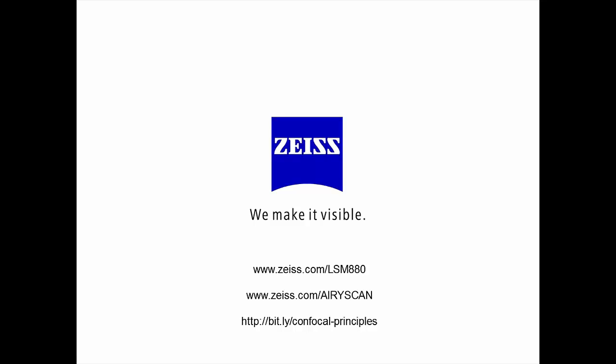And so how does the Airyscan compare to the existing Zeiss Elyra super resolution systems? The Elyra systems come in both PALM, so the localization, and then SIM, so structured illumination. PALM really maintains the best resolution, albeit on thinner samples. The Airyscan is quite similar to, and will be compared to, the structured illumination systems. Simply put, if you want to push the resolution on a conventional sample, structured illumination will let you routinely, day-to-day, get a 2-fold increase, whereas the Airyscan routinely, day-to-day, will give you about a 1.7 increase.